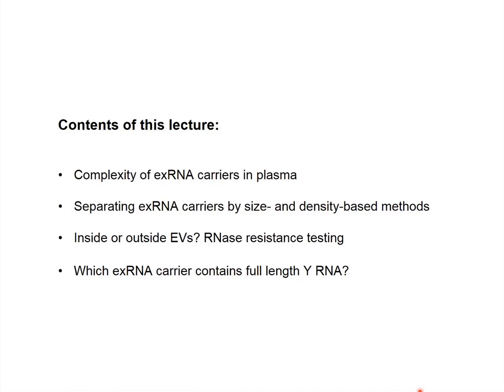In this lecture, we will discuss the complexity of exRNA carriers in plasma. We will discuss size and density-based methods for separation of exRNA carriers. And we'll go over RNase resistance testing to find out whether an RNA is inside or outside of extracellular vesicles. Finally, we'll answer the question of which exRNA carrier contains the full-length Y-RNA.